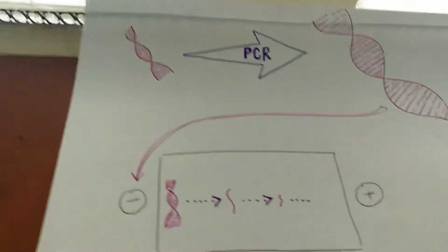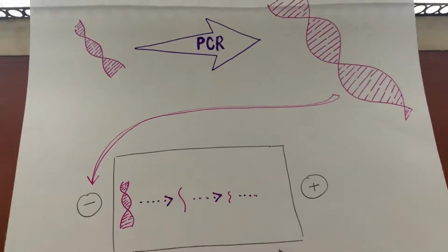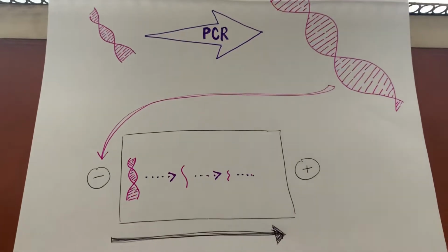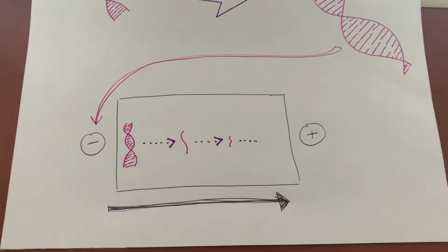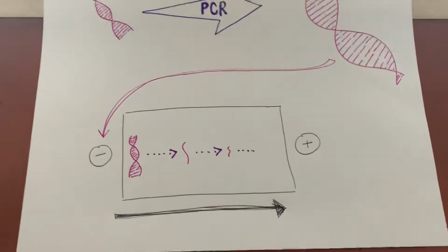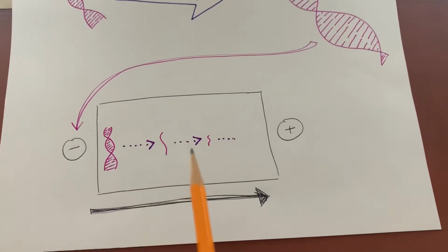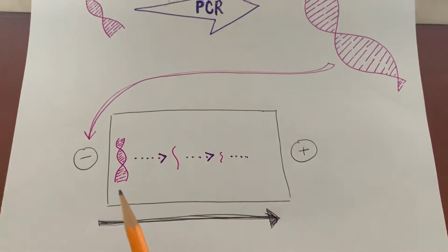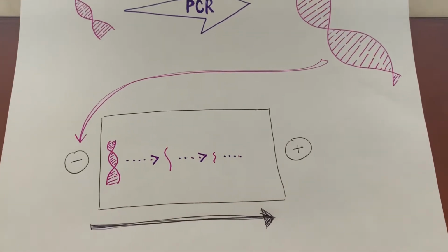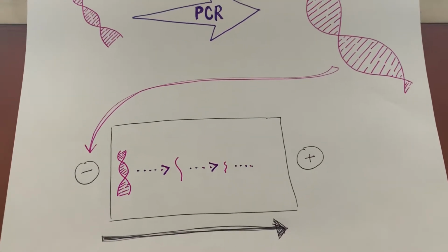Now, first, the DNA sample needed to be treated with PCR to amplify it so that we can put it in the electrophoresis machine. Now, in electrophoresis, the DNA sample is loaded at the negative side of the plate, and the charged particles move through the gel. Smaller fragments move faster than larger fragments, and they leave patterns of bands that can be compared to each other to tell if they're the same or different.